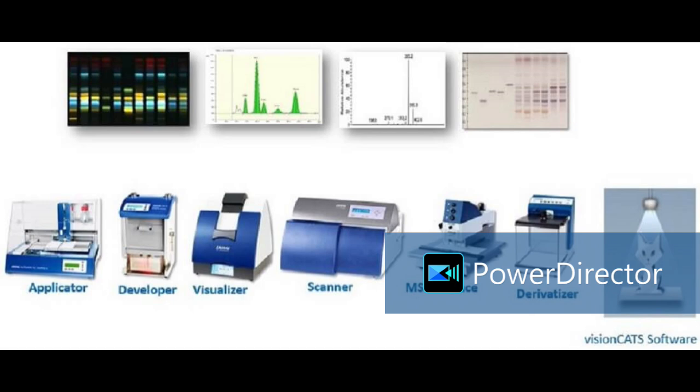So we can elute this band through the MS interface. We can find out its molecular mass in single quadrupole or triple quadrupole MS. We can do structural elucidation, or we can elute this band in separate vials, and from those vials we can go for NMR, IR techniques also. So we can hyphenate HPTLC with other techniques. So the first step in detection is visualization: visible light images, white light image, UV light image and fluorescent light image.